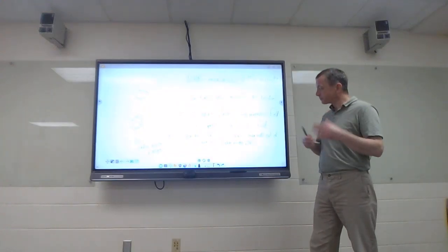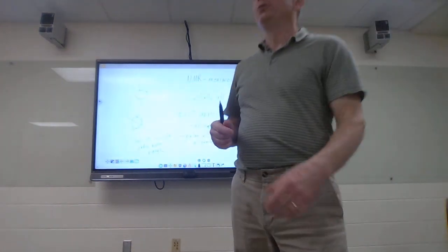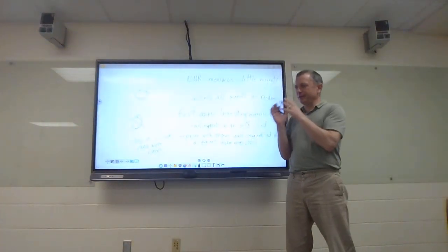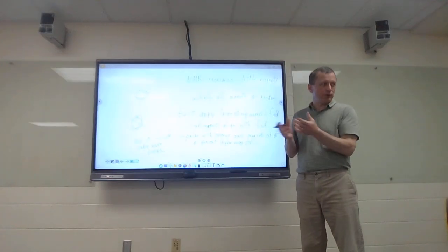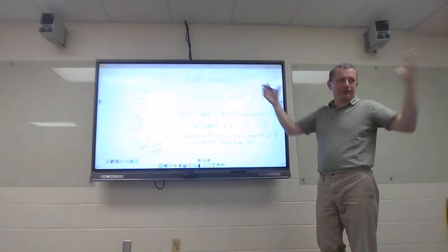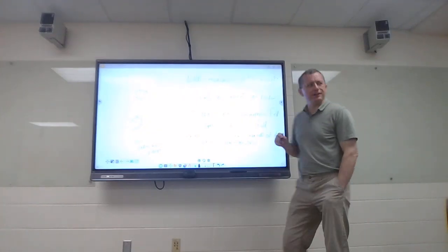All right. And in fact, with MRI, we do take our machines and we tend to tune them, and tuning them has to do with what nuclei we're looking at. We generally don't look at all the nuclei simultaneously. It would take us way too long. We're not looking at everything, we're just looking at a narrow range. All right, like FM versus AM, something like that.